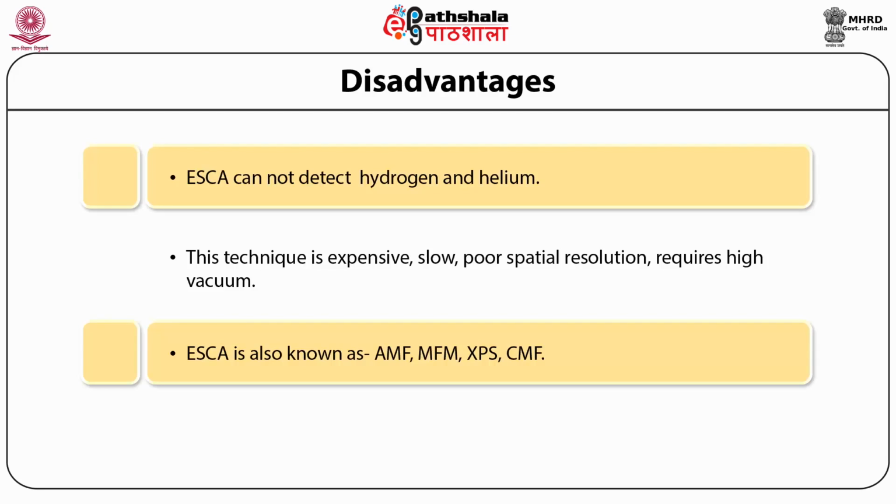The other disadvantage is that if the adsorbed layer has a certain thickness and we carry out the etching in a certain manner, to quote an example, if we carry out etching at 20 nanometers per second, we will etch that and then carry out the surface analysis with ESCA once again.